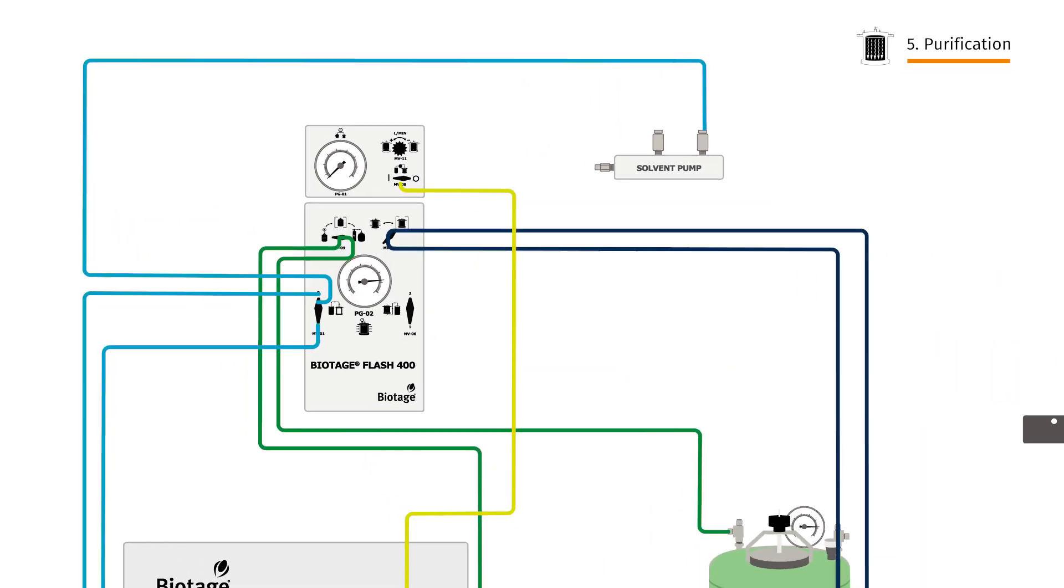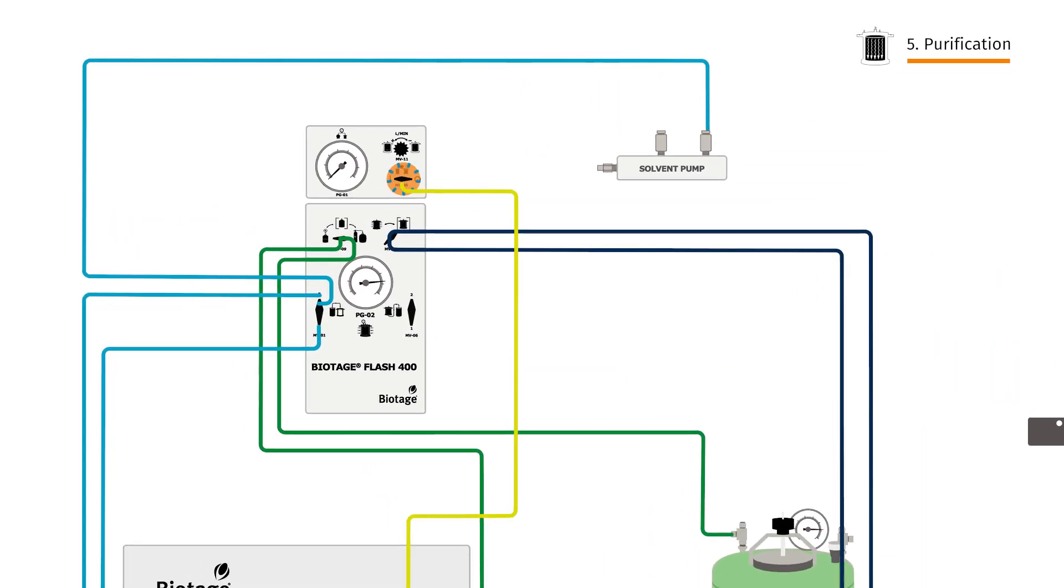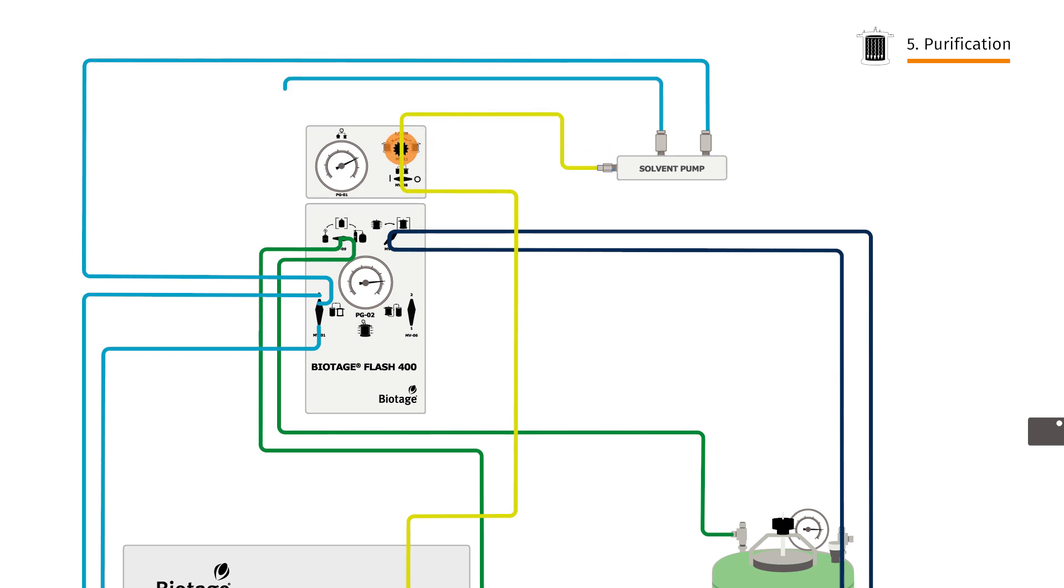Switch the solvent pump back on. Start purification by opening the flow and adjust the pressure as desired.